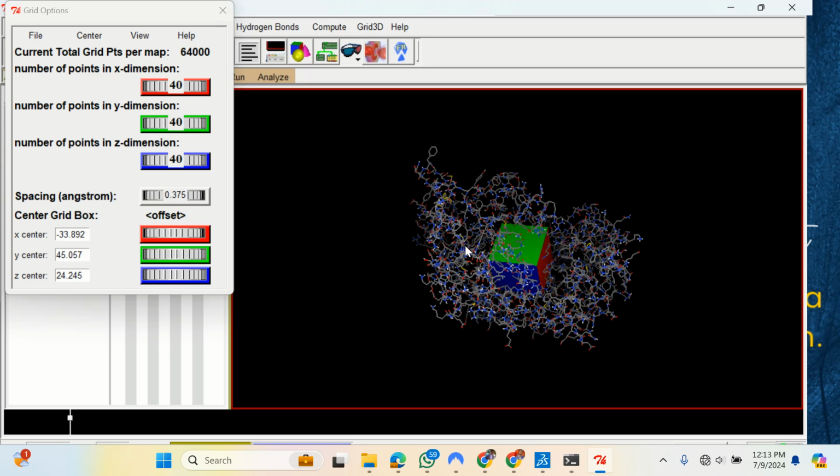But funny enough, this is the pocket where that heme group is. Remember, heme group is a big atom, so it has been assumed to be the main pocket of this protein. But if you didn't study this protein, you simply go and use this as your active site. And by doing so, you are intentionally or unintentionally targeting the wrong pocket. In fact, most people that work with this, except for the few of them that know active site study, will always go and dock here. And when you go and dock here, what they are hoping on is now the one misguiding them.